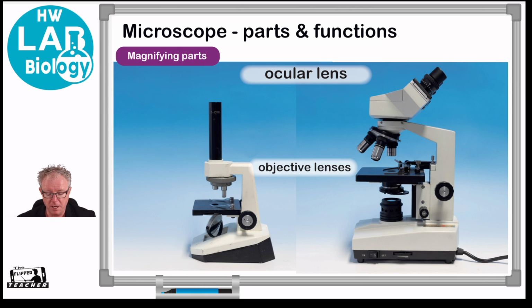Alright, so microscopes come in different types. We said that in previous videos. They can be light microscopes, they can be electron microscopes. And remember, if you do a bit of active recall, what were the different types of light microscopes? That's right, we broke them into simple and compound. Remember, we said simple is when they're using one lens, and compound was when you were using two or more lenses. And then we said that the compound microscopes can be different types: monocular, binocular, and stereoscopic, right?